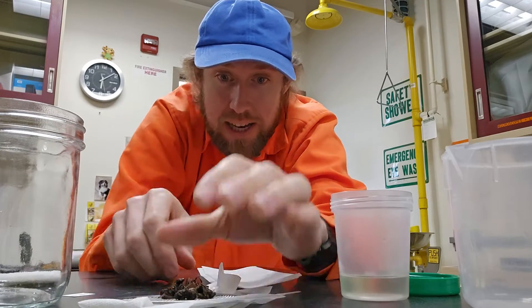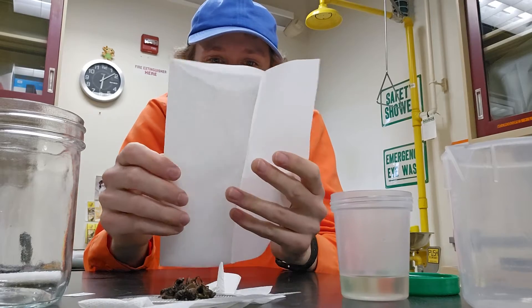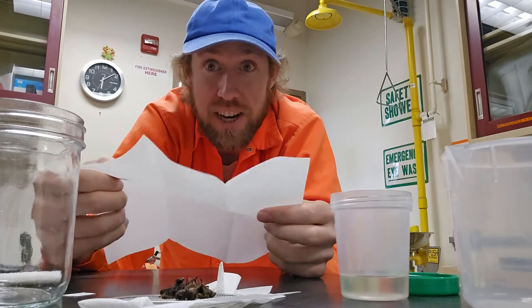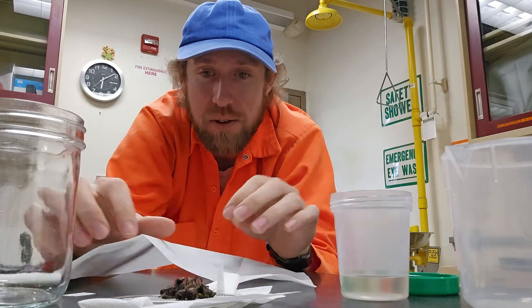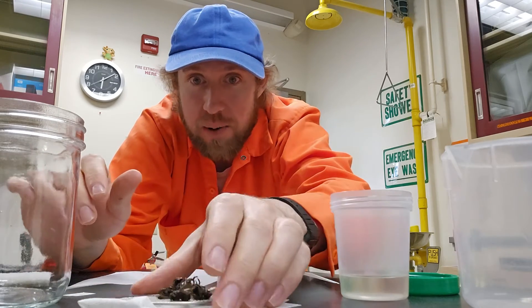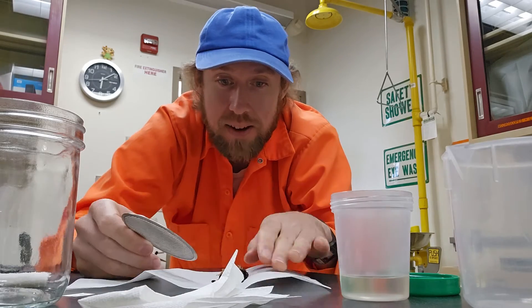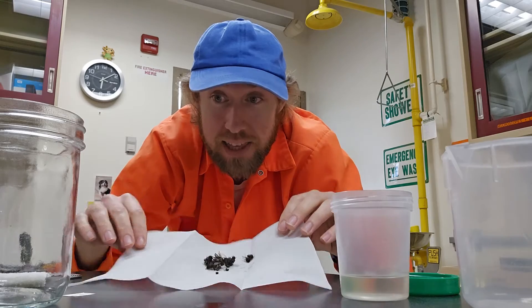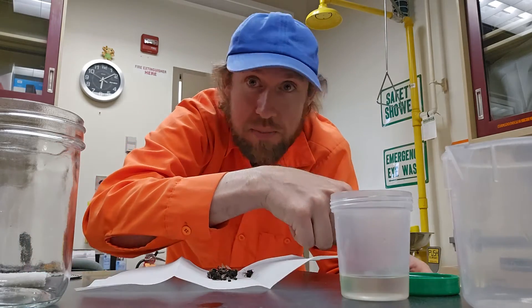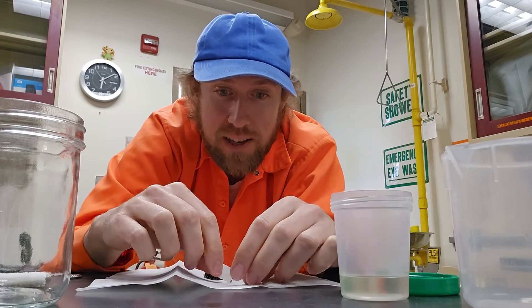Then the next step is to make a little envelope for the final drying stage. These paper towels are really nice because they have a fold built in already. So we just take our bees that are dabbed dry on our screen and plop them down into the middle of the paper towel. Of course, every batch of specimens has a label of some sort — super important. If you lose the label, all this is for nothing.